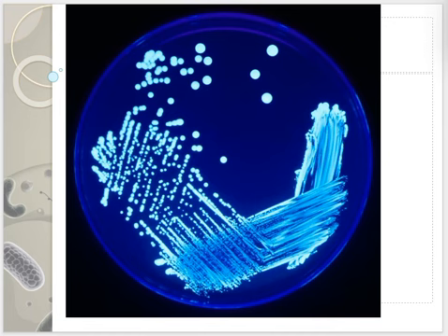When we look at a streaked plate under the right conditions, we can see distinct colonies forming along the streak lines. The denser areas show more growth, while the later streaks reveal isolated colonies. This visual confirmation shows how effective streak culture is at separating bacteria for further analysis.